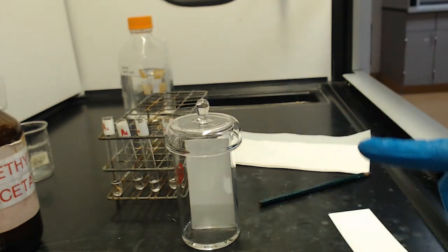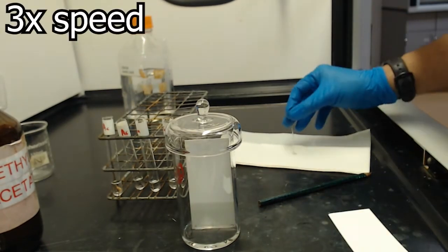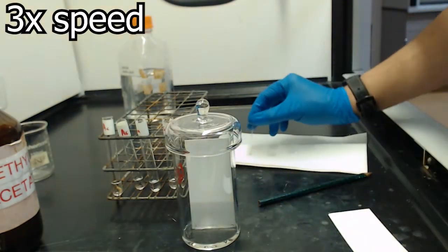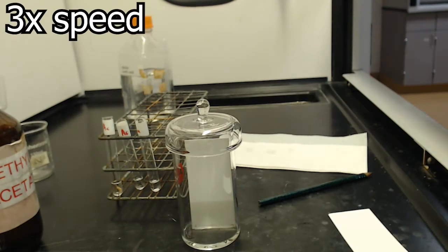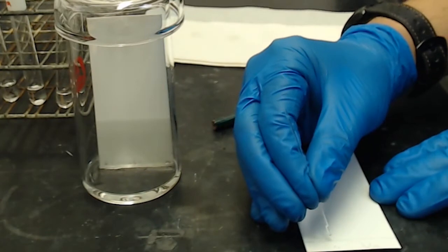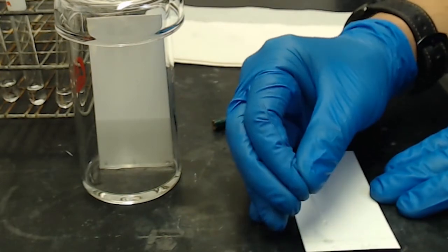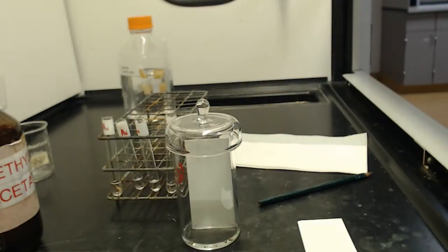Always keep an eye on this. This is one of the activities that tests your patience in organic chemistry, because they take a while, but if you let it overshoot, you have to redo the whole thing. So it's better just to be patient and hang around while it's running. Now is not the time to take a bathroom break. Okay, that should be enough.